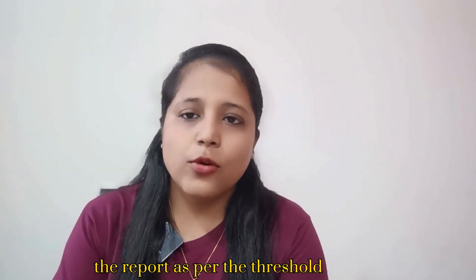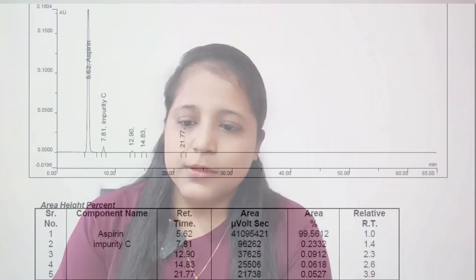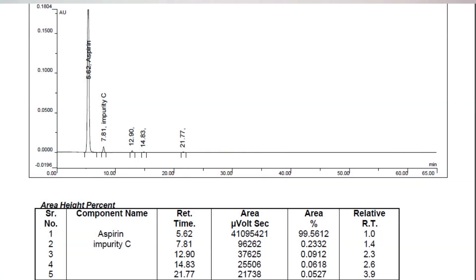For example, this is an aspirin tablet related substance graph. In this graph we can see that aspirin impurity C and three unknown impurities have been detected. The percentage area of aspirin is 99.56 percent, and impurity C is 0.23 percent, which is higher than the 0.1 percent threshold limit, so we have to include impurity C in the report. The other three unknown impurities have percentage areas of 0.09, 0.06, and 0.05 percent, which are below the threshold limit, so they are not reported.